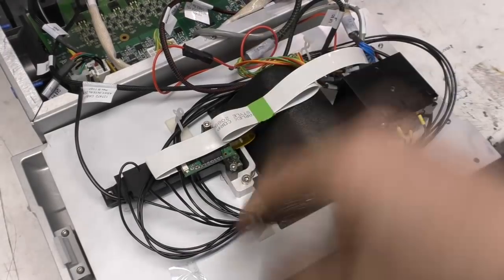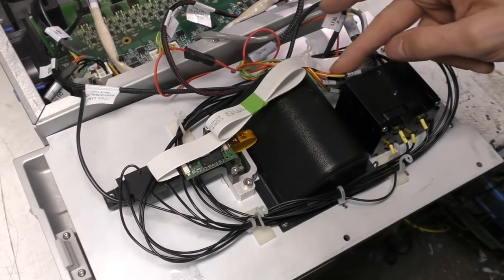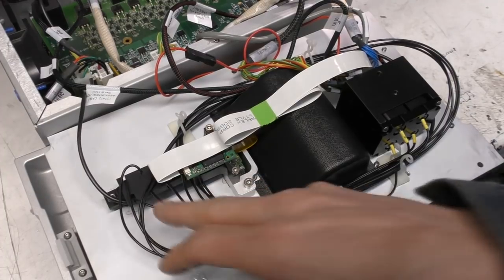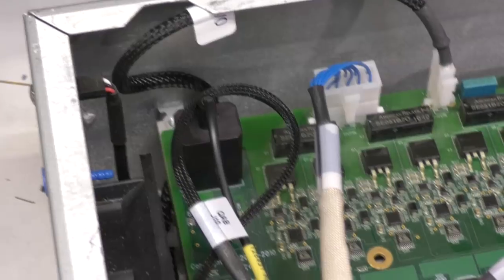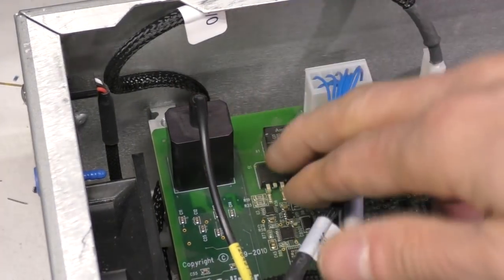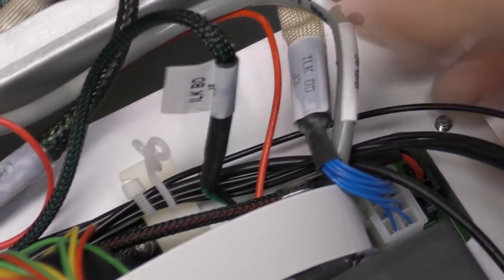So you see on the back of this, there's the barcode reader here. There's an assembly here which I think is probably lasers with fibre optics going out and going into the block here. There's presumably some sort of optical detector somewhere. That might actually be it, there's another fibre here, and that's going down into this block on the main PCB, so I imagine that's probably the optical detector. It's not big enough for it to be a photomultiplier. I don't know, it may just be a photodiode, or we've got a separate cable assembly.